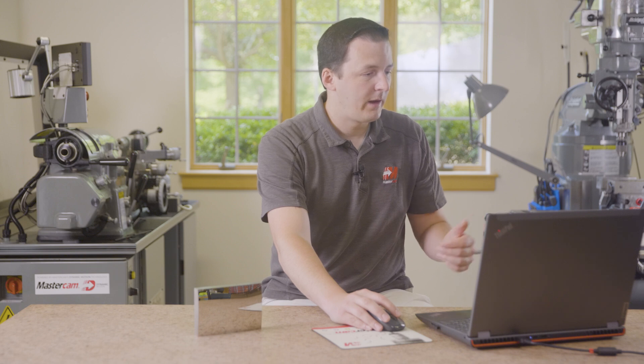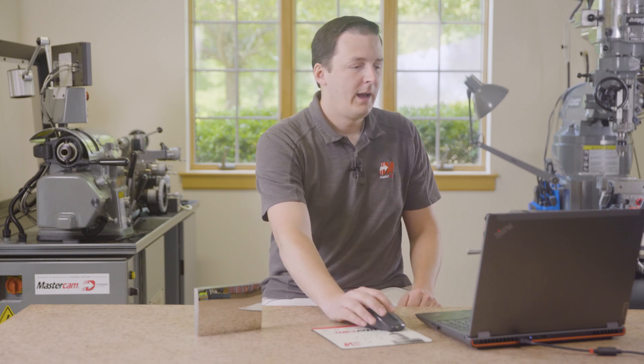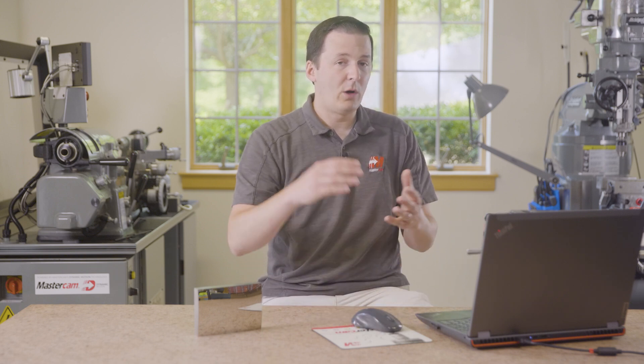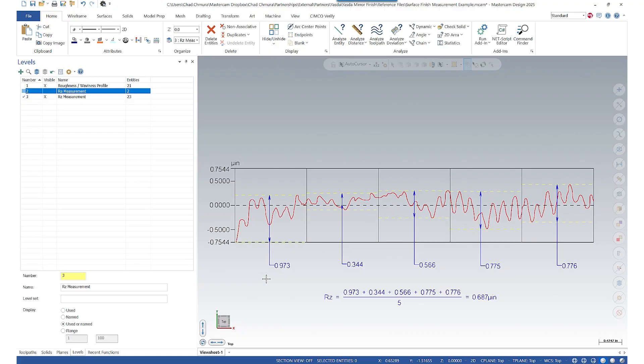RZ, on the other hand, is used more internationally, and RZ takes into account all those peaks and valleys. In five separate chunks, it takes the average of those values, and in this case, the RZ of this graph is 0.6 micro-inch.